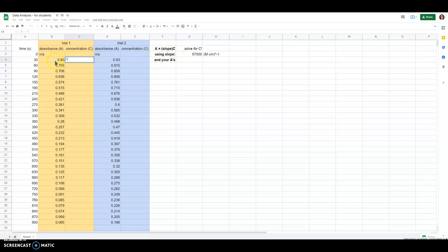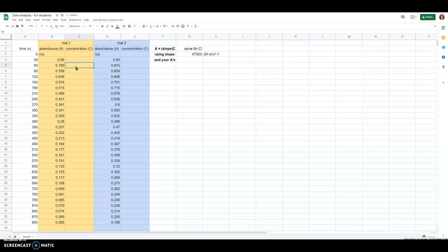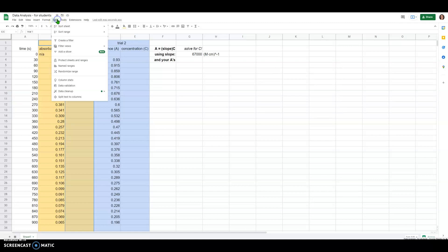I want to take this absorbance value in the first row and divide it by the extinction coefficient. If I type that in as equals B4 divided by G3 and hit enter, that's going to calculate the concentration for me. I'm realizing the value is so small that it's just showing up as zero.